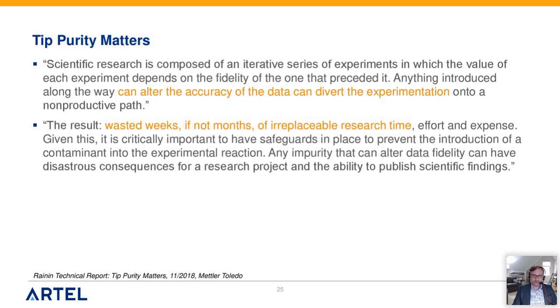So again, there is a potential, and this happens actually quite frequently, wasting weeks, sometimes months. You're going down a series, a whole campaign of screening or testing, and then you realize that there's a drift in the performance of your assay, and a lot of times it can be traced right back to this. So let's address this right up front, and that's really what this webinar is about.